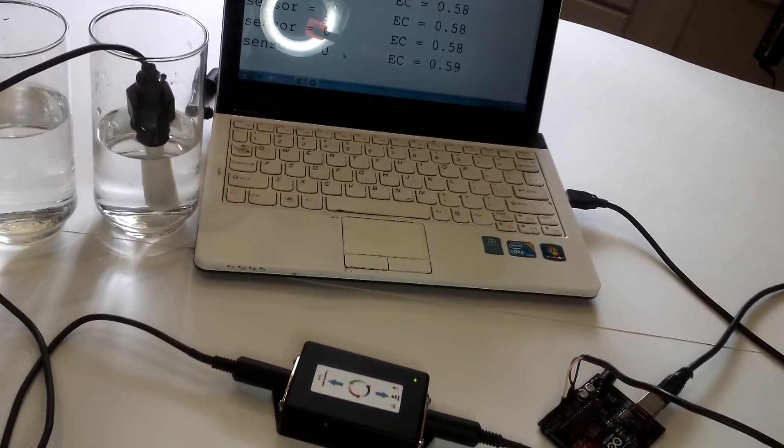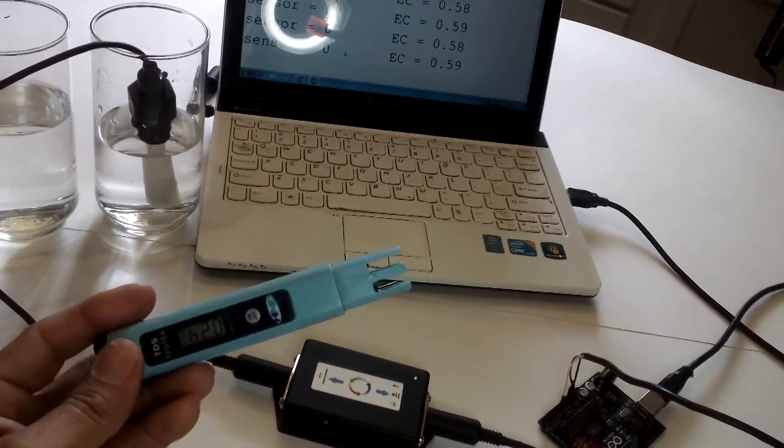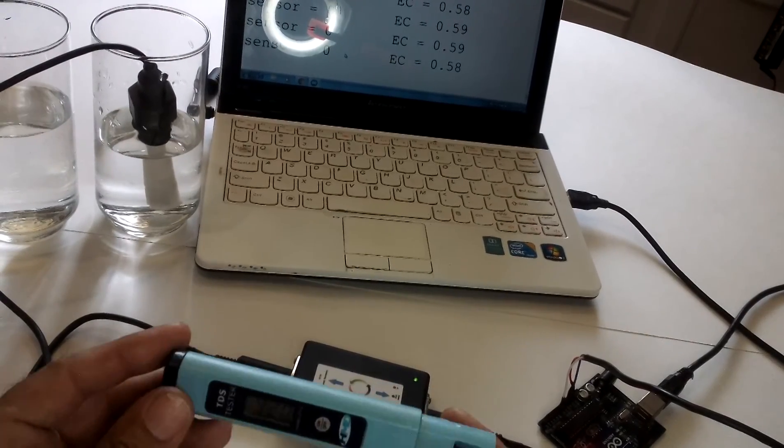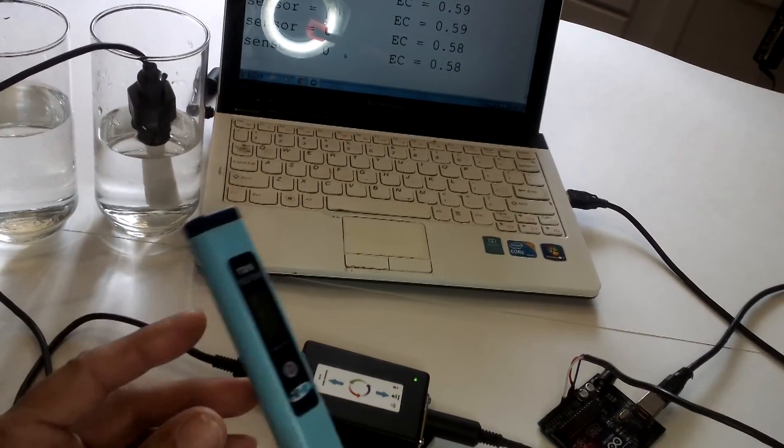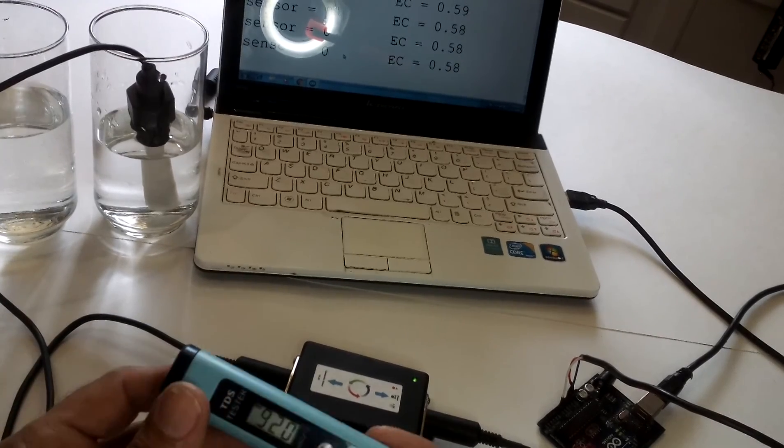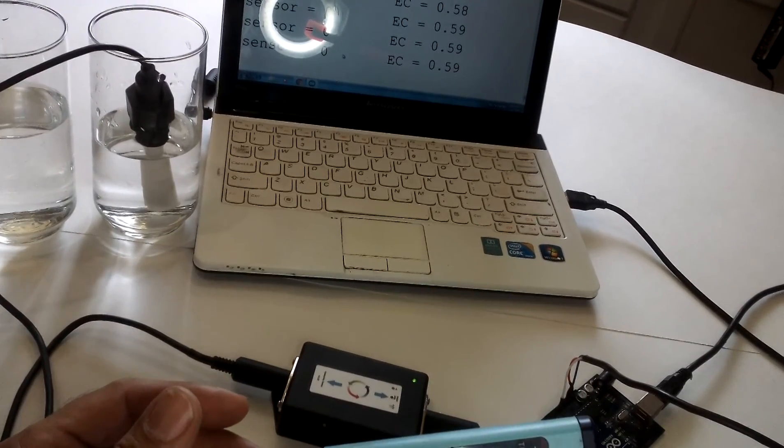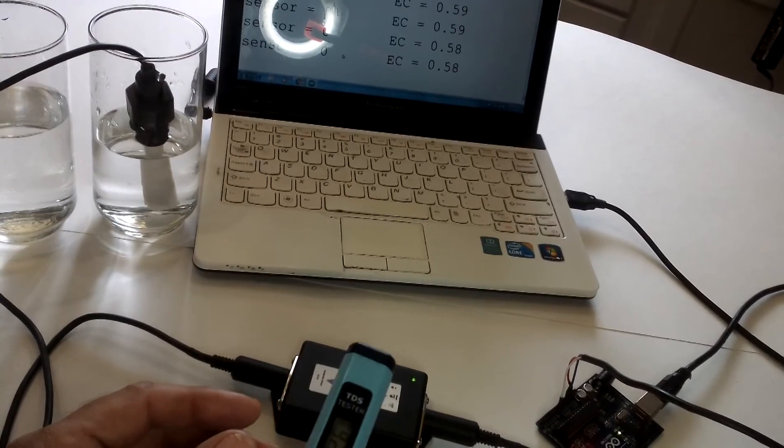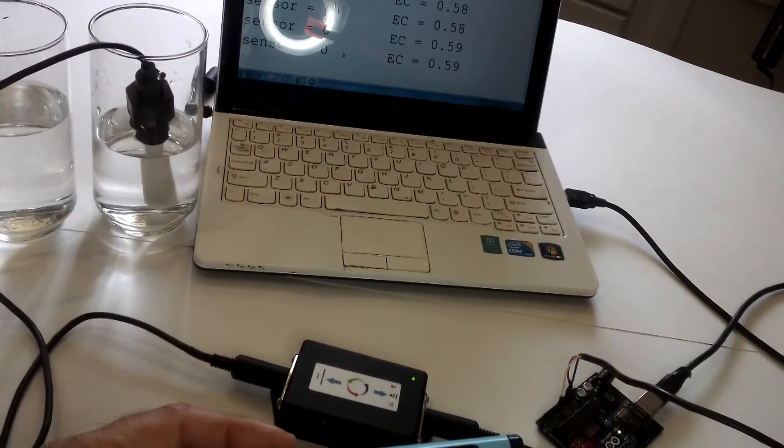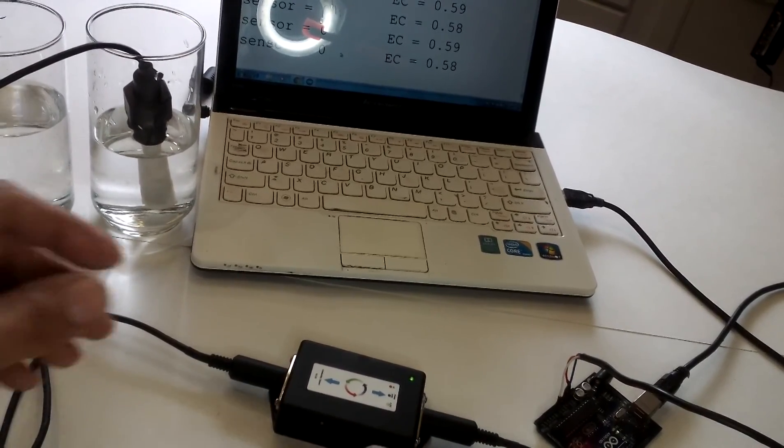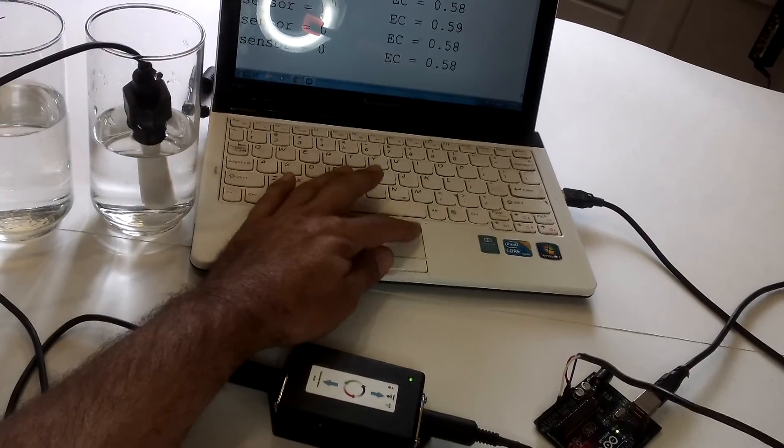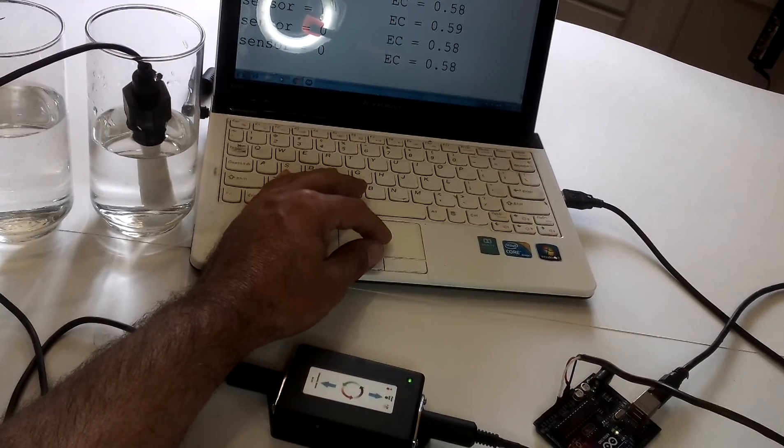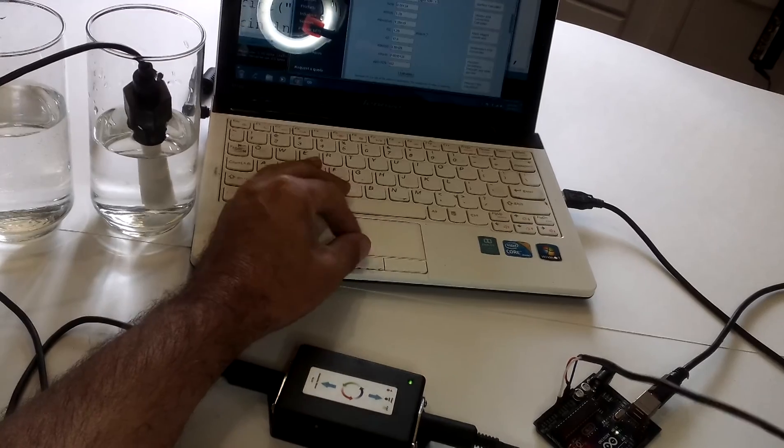Now let's, I do have a ppm test meter, TDS meter. And let's match. Since this reads ppm, let's match, let's change the sketch to ppm and see how close this unit is with the sensor. Measuring ppm. Let's see.